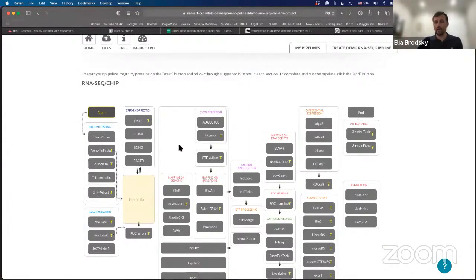So when we take raw sequencing data, we would like to clean this data. We would then like to map it on the genome, make sure that we are capturing the isoforms and recording them in the GTF file, mapping this information on transcript, so we know transcript abundance by quantifying expression levels, and then performing differential gene expression, or even just preparing our table of expression for downstream analysis.